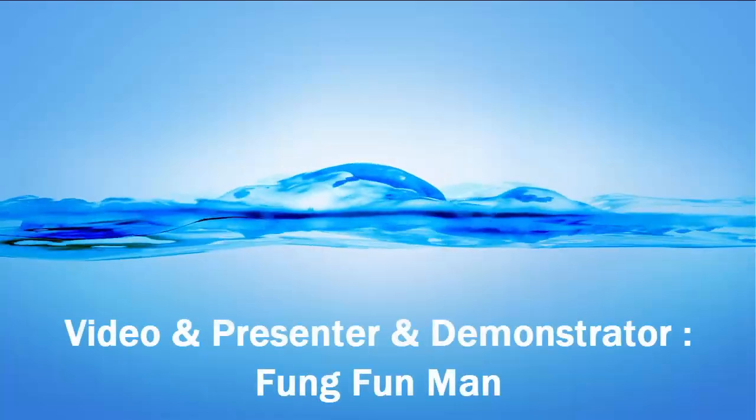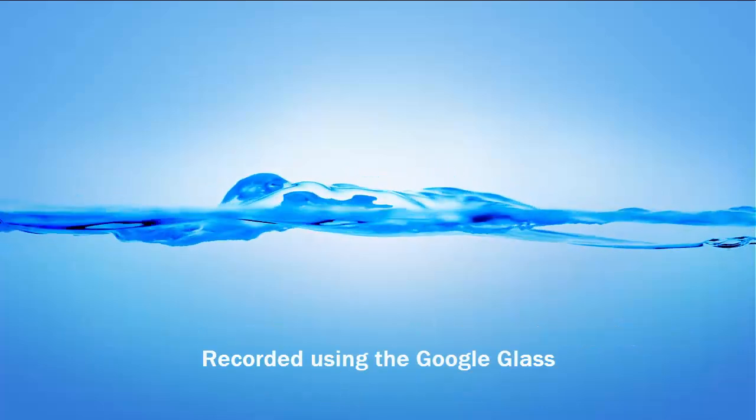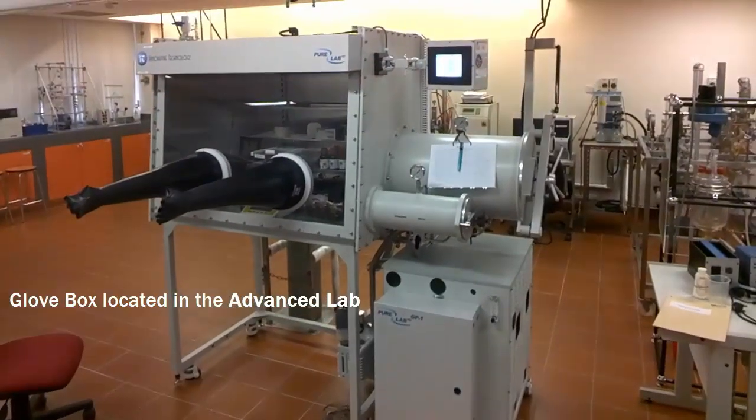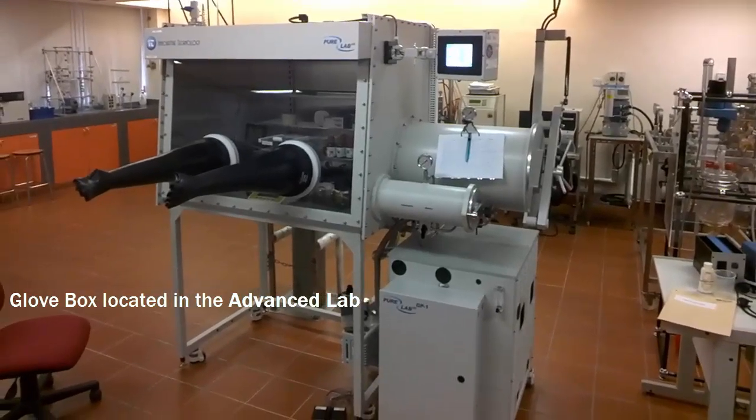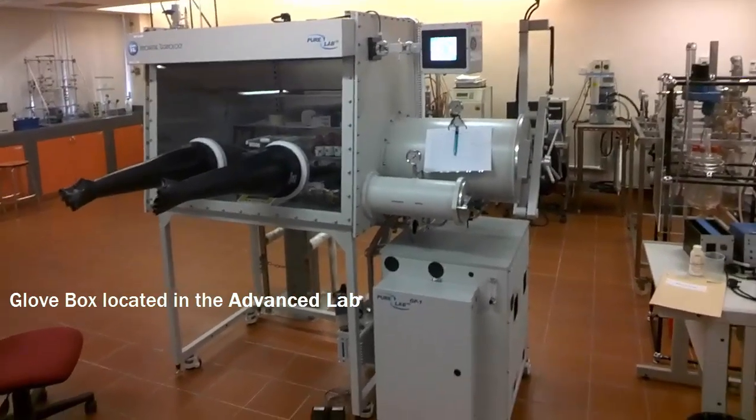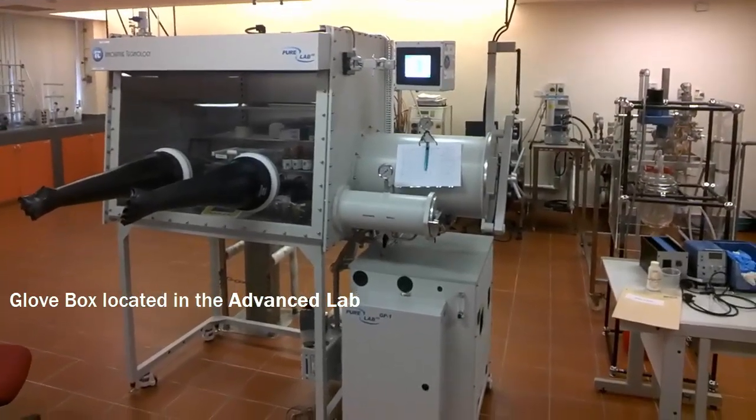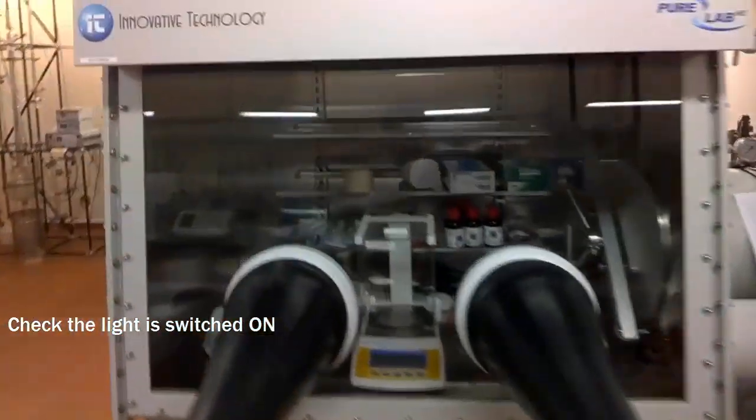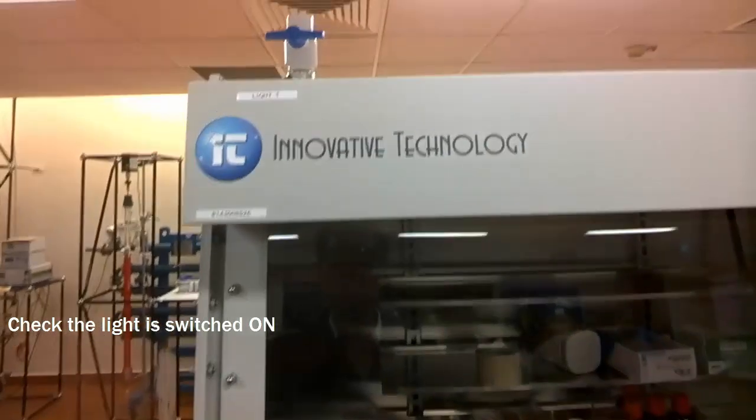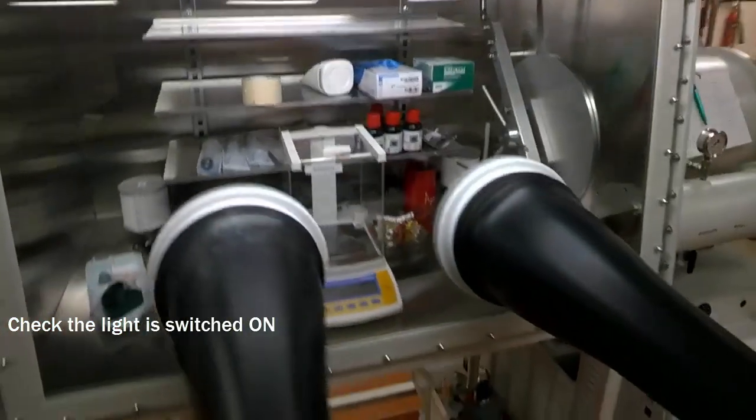Hi, in this video you will learn about how to operate the PureLab High Efficiency Glove Box. What I have in front of me is the PureLab High Efficiency Glove Box located in the Advanced Lab in the Chemistry Department of NUS. The first thing you have to do when you approach the glove box is to check that the light system is on. The switch for the light system is located at the top roof of the whole box. You can see my hands pressing on it. There's a label that says light.